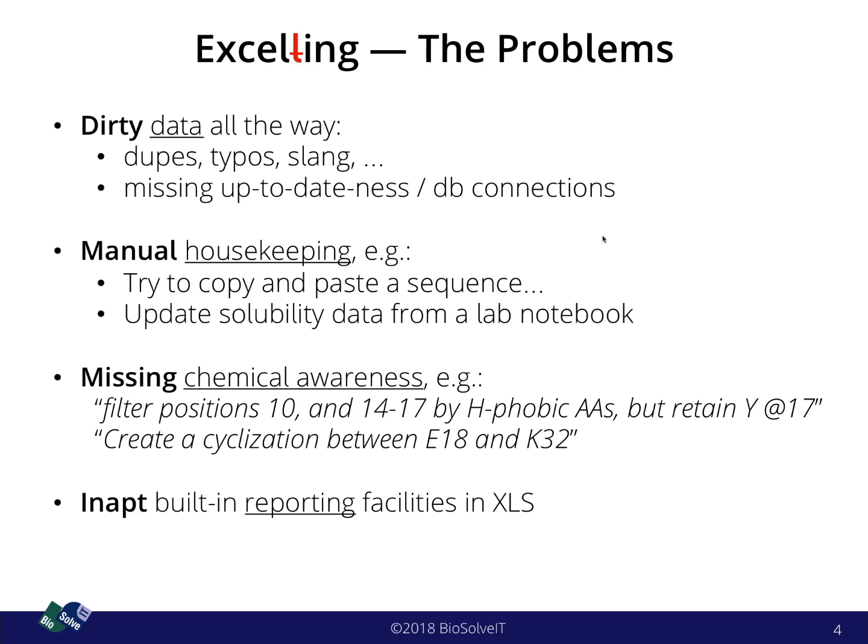Finally, also once you have worked on something, you would like to tell others about it. You would like to report to your boss, to your colleagues. You would like to write a paper about it, perhaps. And also here, we have found the reporting facilities, even though they are vast in Excel, sometimes simply inapt for peptide therapeutics.